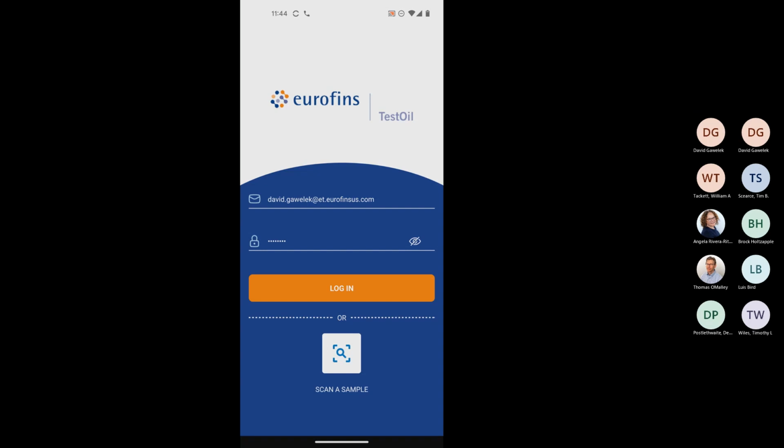Now, with that said, this is version 1, we'll say, of this app, and we have planned several further releases, and we have a further development pipeline because we were planning on building in continuous improvements. We figured we were going to get more feedback and more suggestions about useful features. And that sounds to me like something that we need to get into our development pipeline for a future release. So that's an excellent question, Louis. I appreciate that. I'm going to put that on our list of features to add to the app.